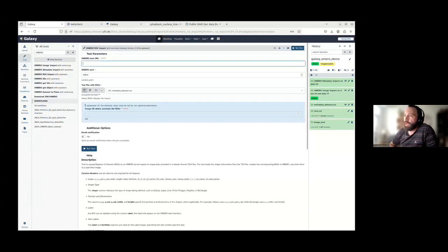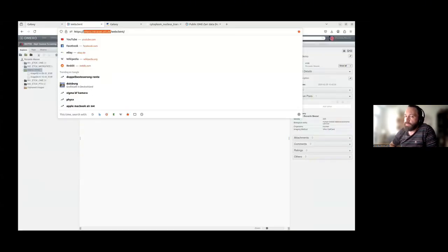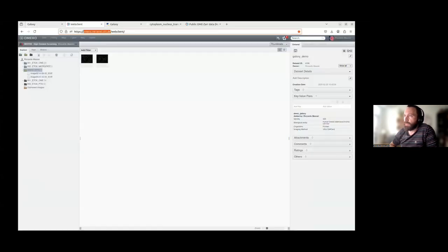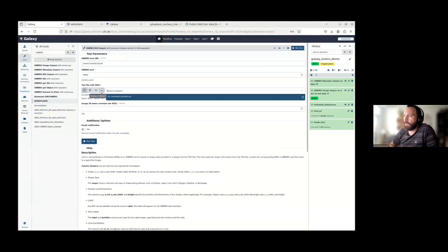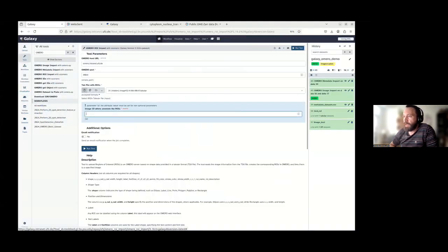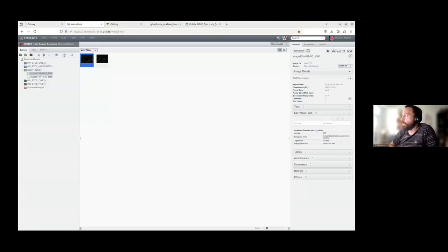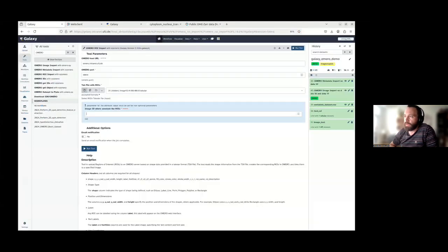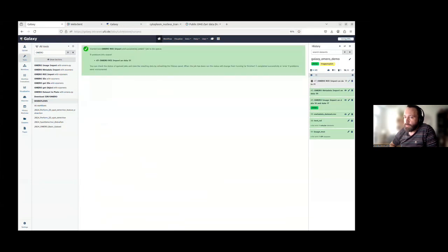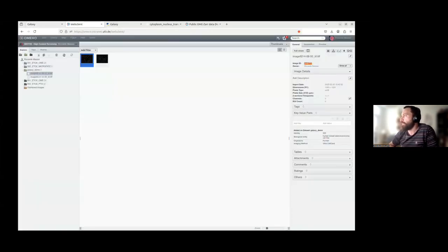As I said before, we can import also regions of interest that can come out from analysis. And for this I just have to select the tabular file with these rows. And again, I have to select the image ID where I want to associate this region of interest. And after this, I just run the tool. It's queued again with the status gray. It will soon switch to yellow. It means that it's working.